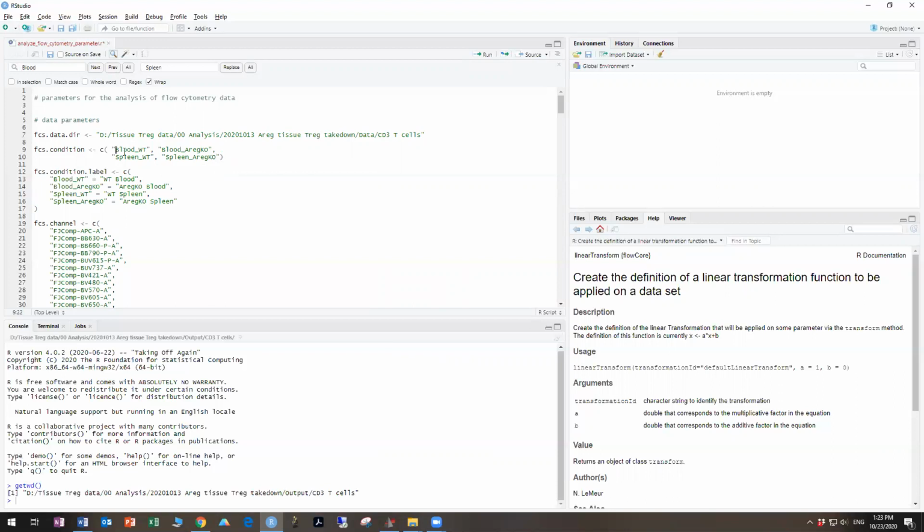The order that you put the groups in here defines the order that they come out in some of your analyses downstream, particularly in the bar chart showing the frequency of the clusters. So in general, it's good practice to always put your wild type before you knock out. Otherwise, think about what's the biological relevance of doing these things. If you're interested primarily in, say, lung, put lung first. If you have a control data set, put the control data set first, and so on. You would need to come back and rerun the entire thing, redefining this if you put them in the wrong order. Rerunning is actually relatively quick because you'll run the tSNE from the cached file.